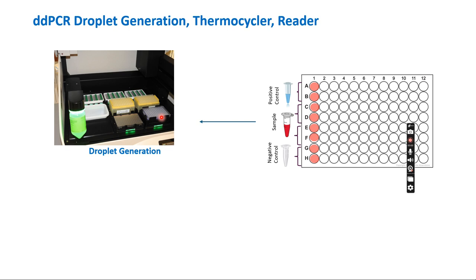So remember, this is the step to generate droplets, which will be generated by the machine, but you have to put a new plate to collect the new droplets. When it makes the droplets, if you have a full plate, it takes approximately 40-50 minutes. And if the plate is not full, it will be much shorter, like the plate I selected, it will be done in 10 minutes.